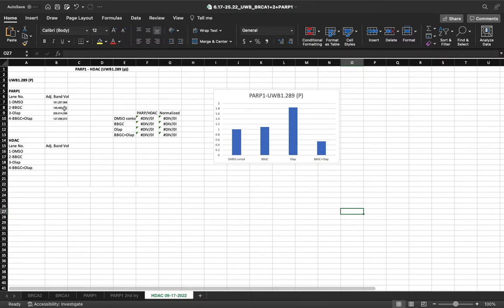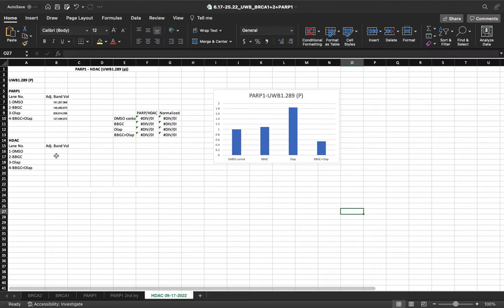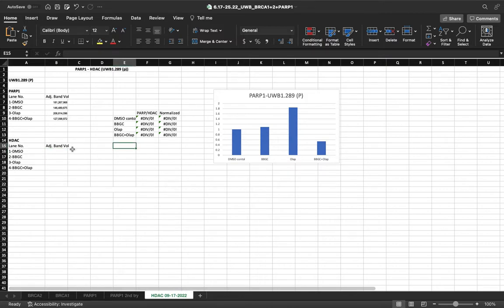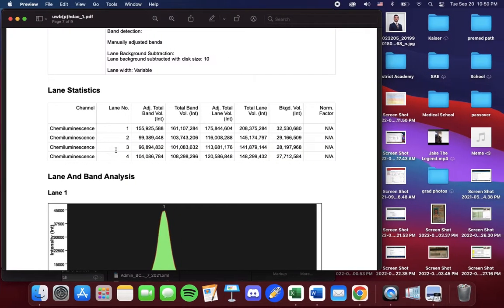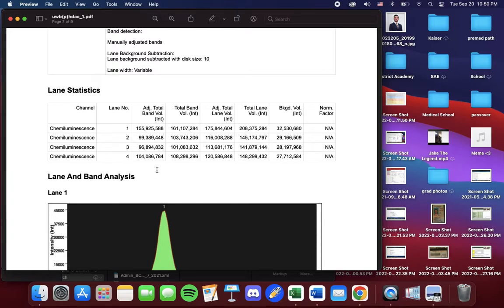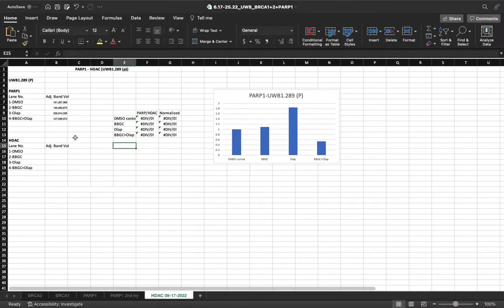Now, I have previously entered numbers into the adjusted band volume. So I'm going to enter in the adjusted band volume for HDAC. Now, we see adjusted total band volume. This is the data that we want to use. So I'm going to select, copy, and paste.